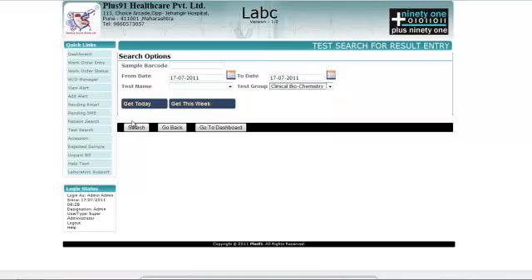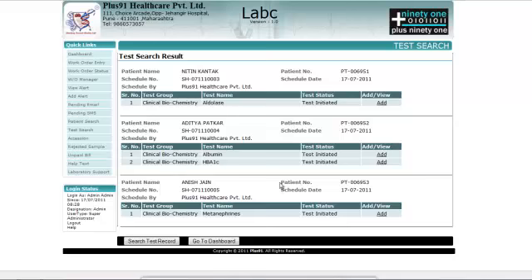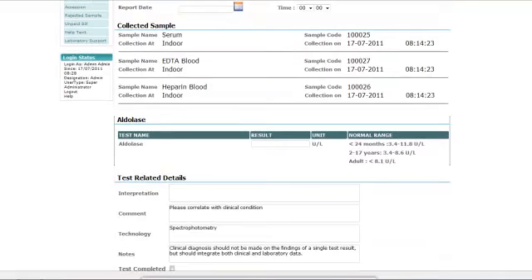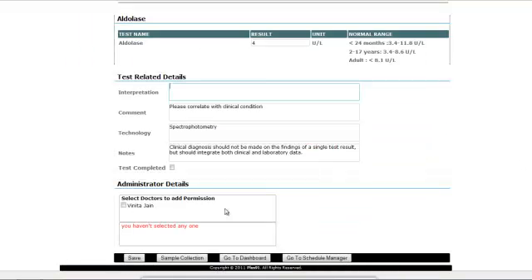Similarly, there is a reporting module. Here you can select reports of different groups, different tests, etc. These are all reports together and you simply click on add to add the template. Once added and saved, you can actually go to the next template from this very screen, hence saving the person time. As you can see, we have a template based system.